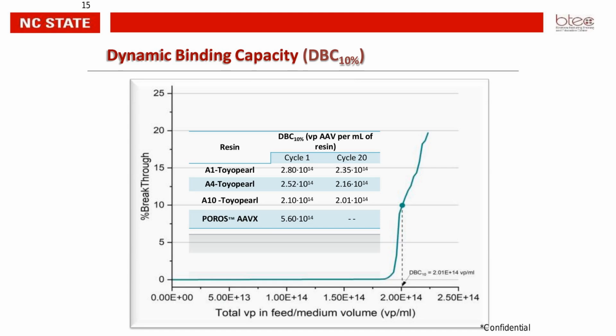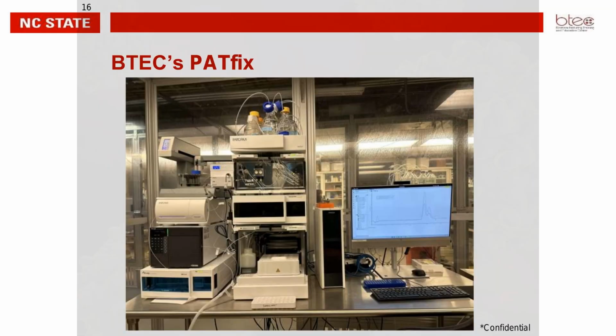All the data that we saw until now were typically from different plate-based assays, wherein you determine the concentration of a sample targeting a specific molecule. But what exactly is present in the whole sample is much better visualized when you get some visual confirmation. So that's when we started integrating HPLC-based methods, and looking into integrating the PATfix platform here. This is an image of the system that we have here at BTEC.